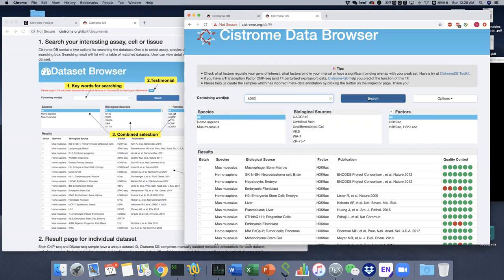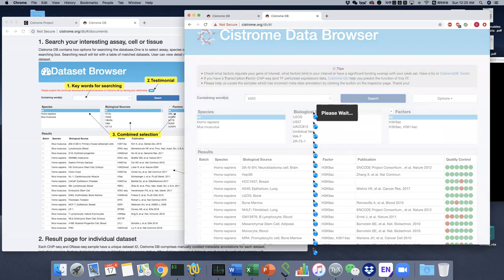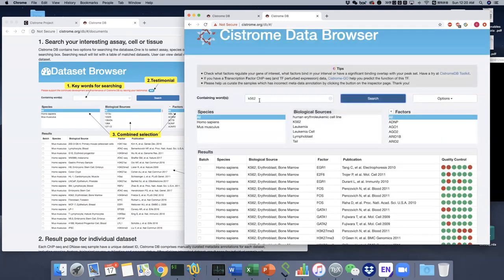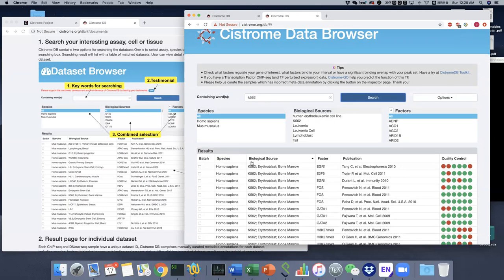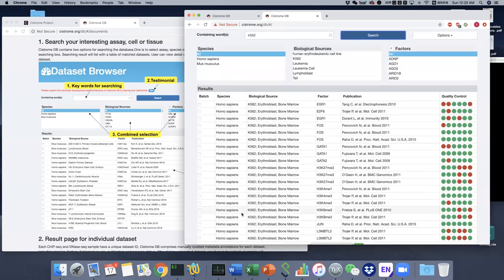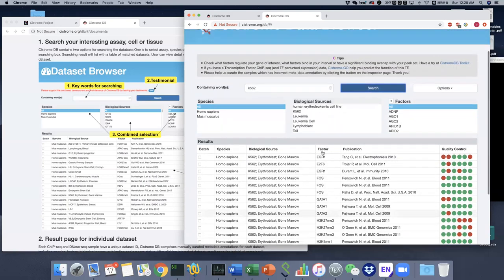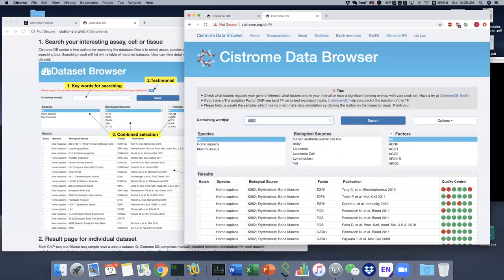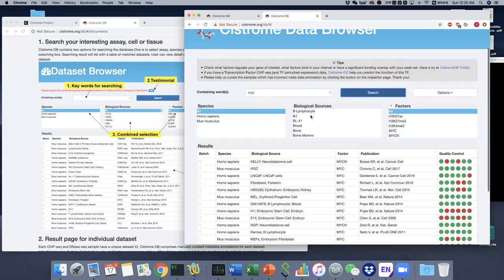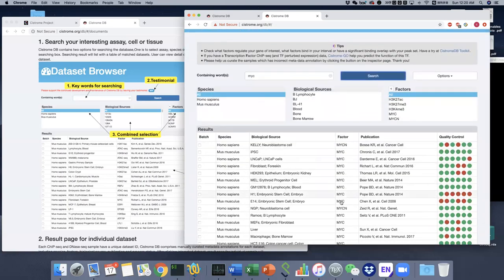The good thing is you can type the factors or the cell lines you're interested in, which makes your selection more clear. For example, if I'm interested in the K562 cell line and human only, I can show all datasets related to this cell line across all factors. Similarly, if I type MYC, I get the MYC factor data across all biological sources. This text box search is very convenient.